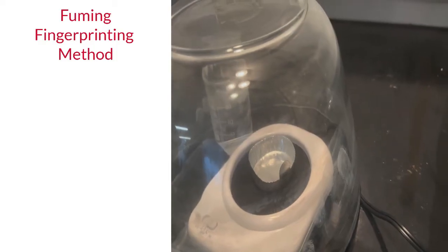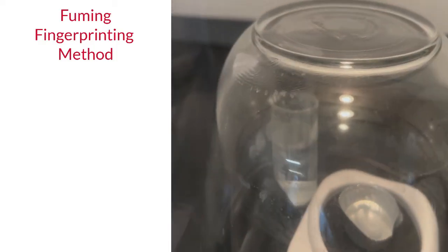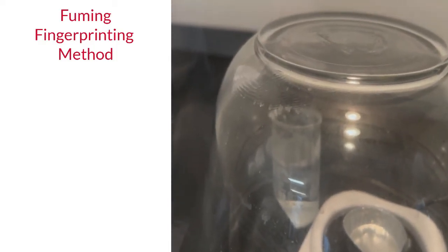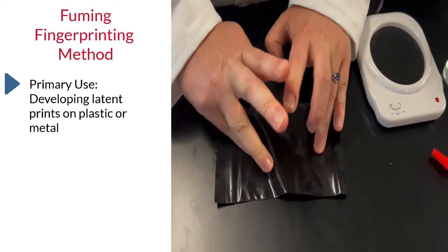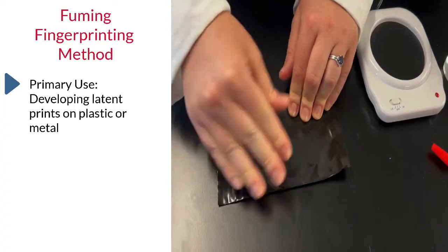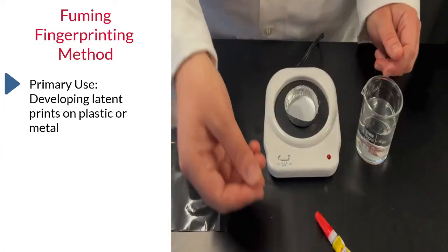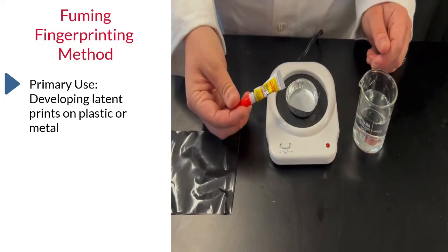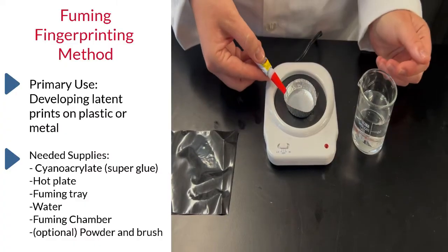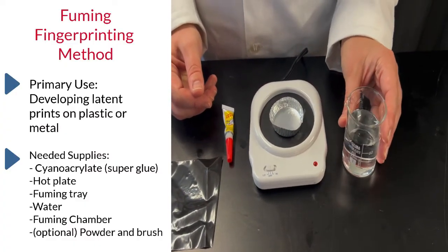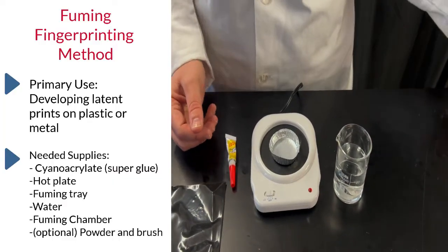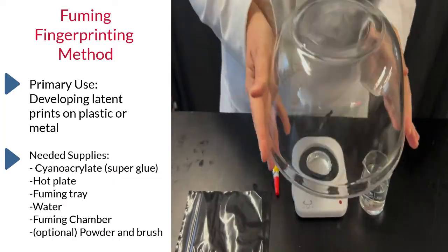The fuming fingerprinting method evaporates cyanoacrylate or superglue to attach and develop prints. The primary use of this method is to develop latent prints on plastic or metal surfaces such as those of common household items. The materials needed to perform this include cyanoacrylate or superglue, a hot plate, a fuming tray, water, and a fuming chamber. In this example, a glass bowl is used for a fuming chamber for easy viewing.